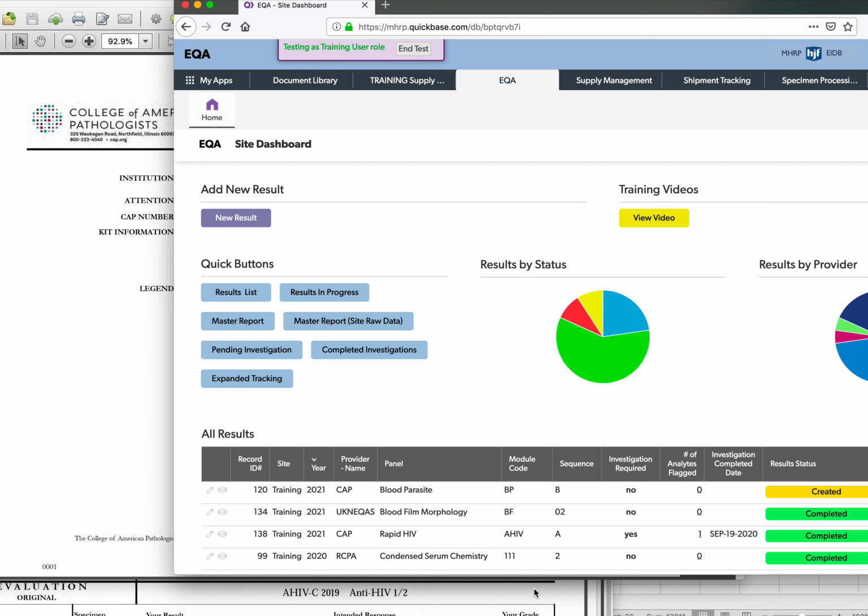There are a few things that I just wanted to go over for you to help when you begin to enter your own EQA PT results.